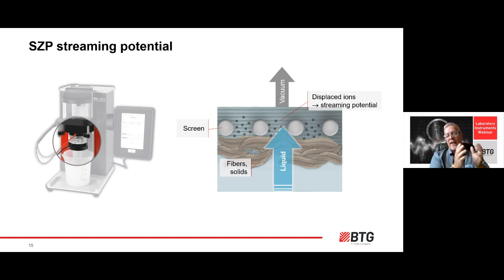And you're simulating the same thing you're doing with the Teflon plunger and the PCD. You're creating movement next to the surface of the fiber, and it's looking at the group of ions that have gathered around the surface. And as they move up and down, it's measuring that potential. That is how the zeta potential reading is given, and it's given in millivolts. The way the information is created is the same. The difference is it's not as discrete as the Mutec PCD because you're not now titrating the fiber surface. You're looking at that millivolt reading.